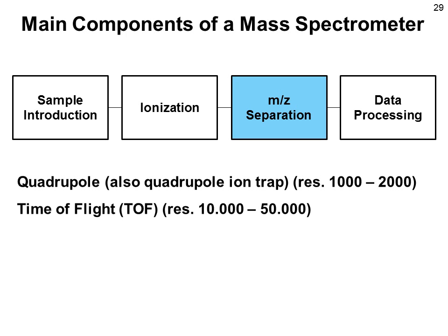The next mass analyzer we've already heard about a little bit is the time-of-flight mass analyzer. This is an analyzer that simply measures the time of flight of an ion from the entry of a flight tube to the detector. This time of flight, as we will see, is related to the mass-to-charge ratio. The time of flight mass analyzers with modern improvements can reach up to 50,000 resolution and is considered a semi-high resolution mass analyzer.